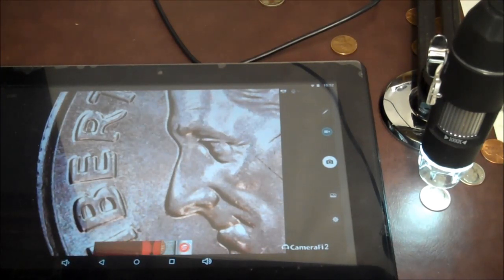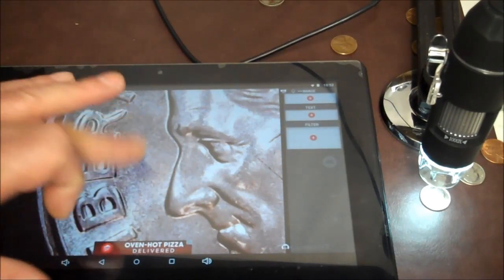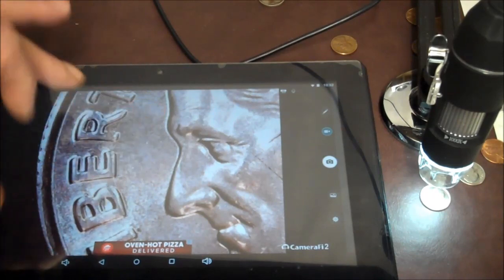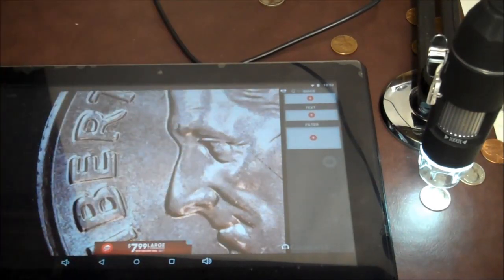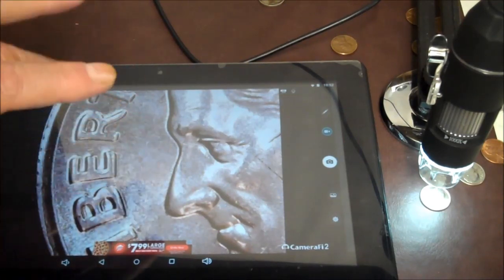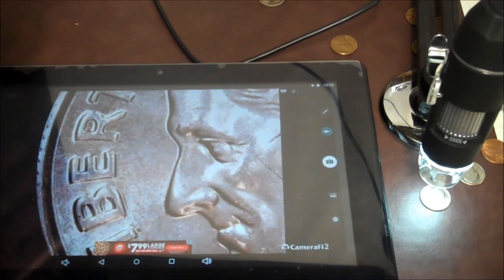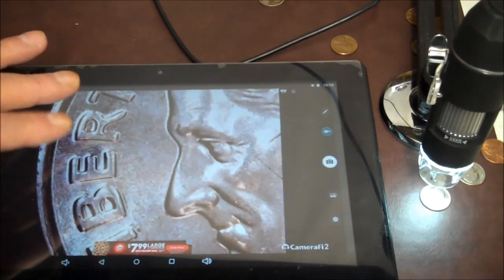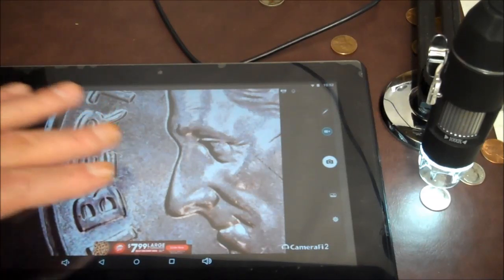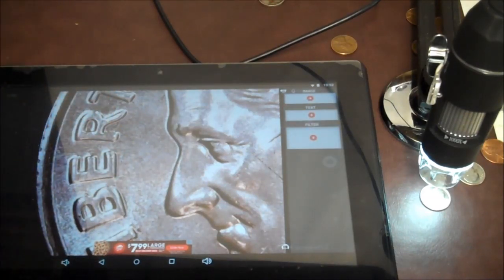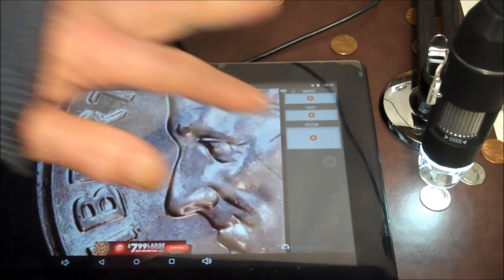So anyway, that's about it for this thing. I guess you could say I'm kinda disappointed. Oh, there's the filters. I wonder how I got that by hitting this. See what I mean? Don't, it don't wanna always come up. Oh, there it is. There it is. So now we have filters here.